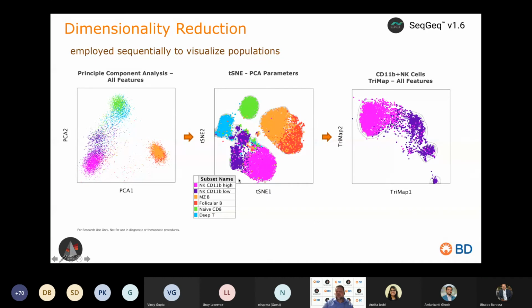It's similar to gating down to a lineage and then focusing on it, as we've discussed earlier tonight, or this morning for you guys. But now you can take any of those subsets. You can merge them together using Boolean gating, or however, I've got these subsets and I can merge them together and look at all of my NK cells separately, right? I don't have to always look at the wide angle lens view. Instead, I can zoom in by focusing on a gated set of populations and then using an alternative method to spread them out within this dimensionally reduced data space.